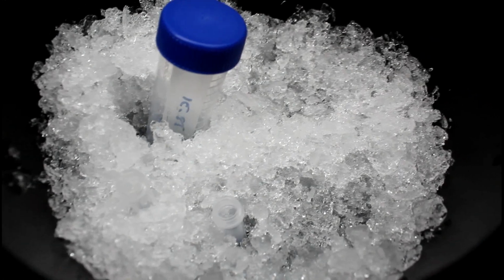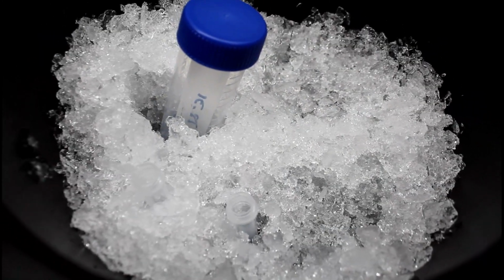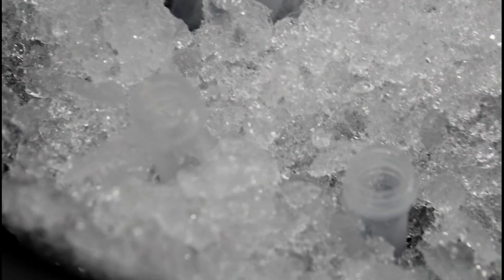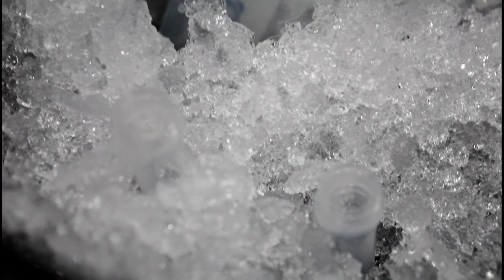If there is any sample left over after this, you can continue alternating between nucleotide and cytokine aliquots. The nucleotides 200 to 500 microliters, the cytokines 200 microliters until you're finished. Store all of these supernatant aliquots immediately at -80 degrees C.